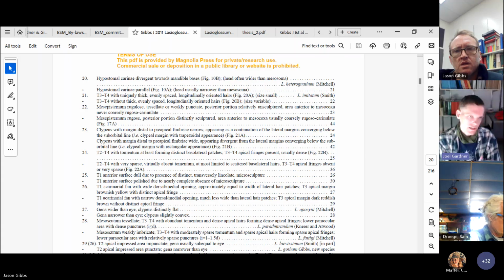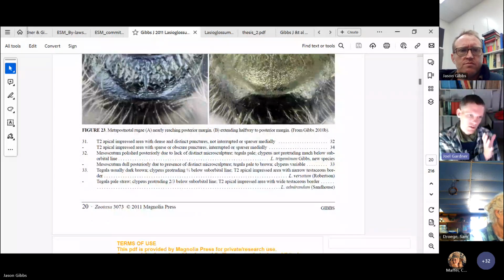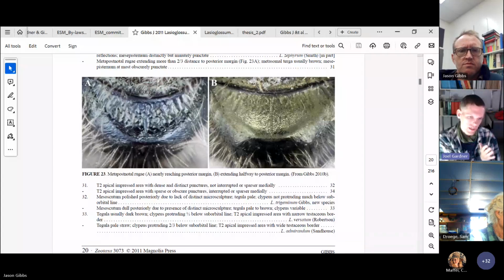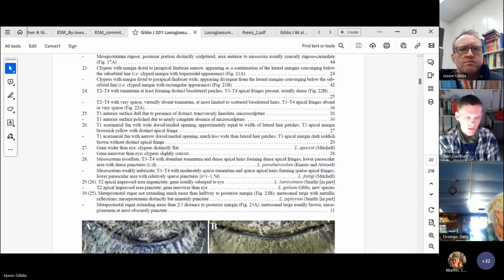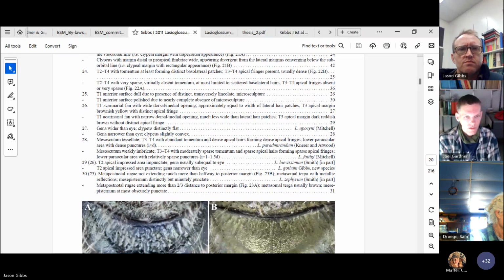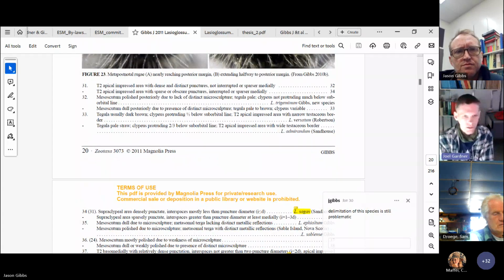Yes, even if you can't see that inside edge bend, the outside edge is still sort of bent. It follows the short flat clypeus, whereas when the clypeus is more protruding, the mandible more gently curves to follow the line of the protruding clypeus when they're closed. So that's a general characteristic you can look for if the mandibles are closed.